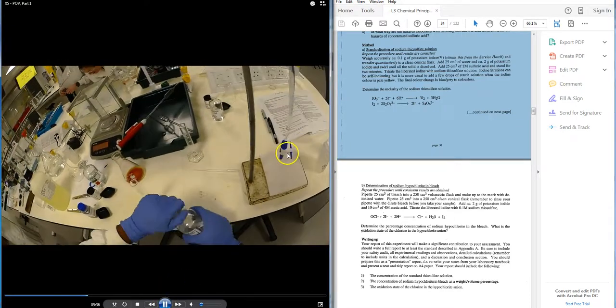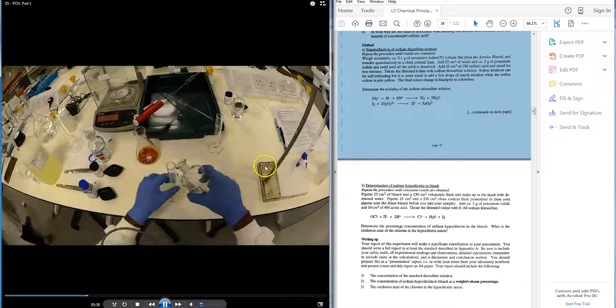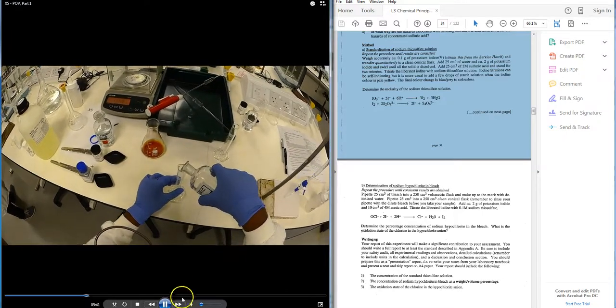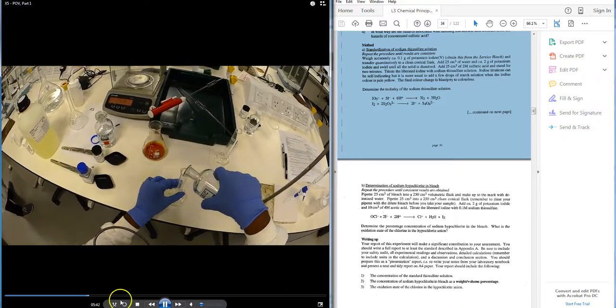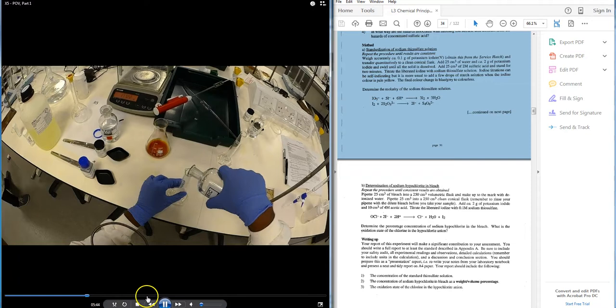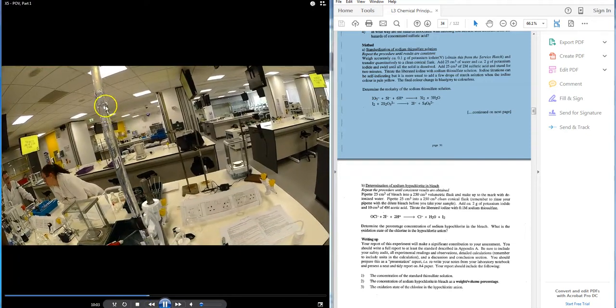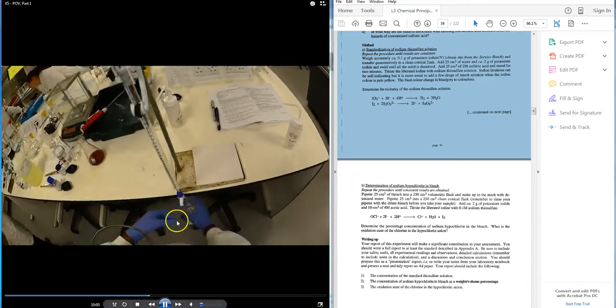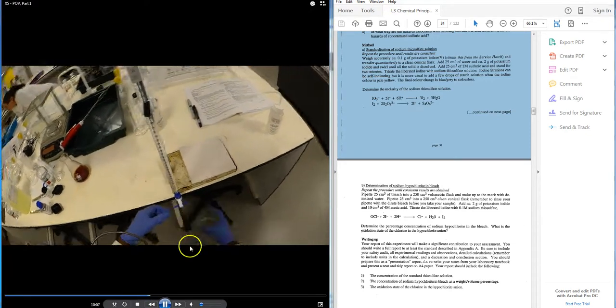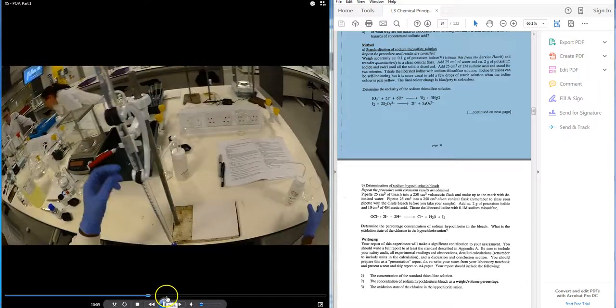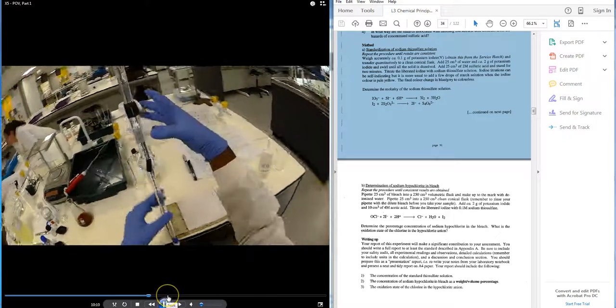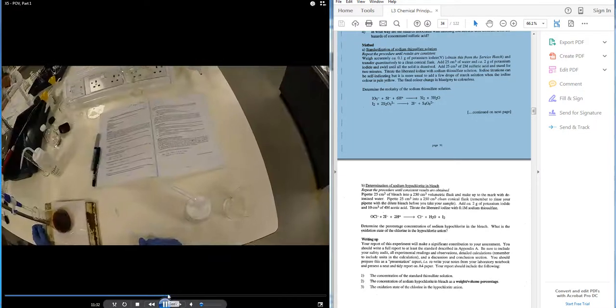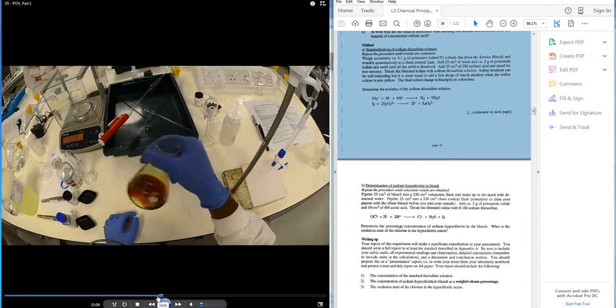You will need to fill your burette up, as asked here, with the sodium thiosulfate. So I'm going to move this forward. So the student is filling the burette up with sodium thiosulfate. I'll show you how to do this more in the laboratory as we move through this.